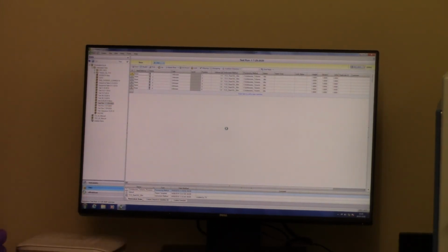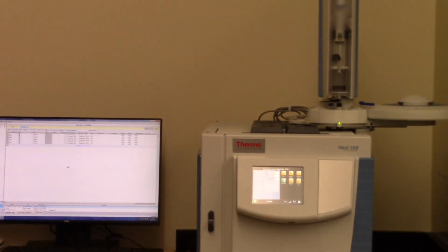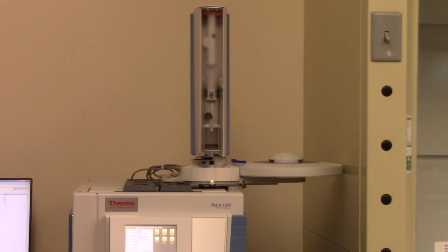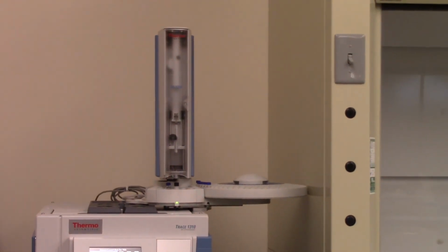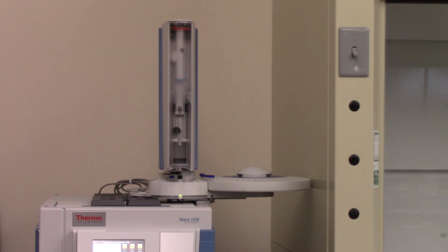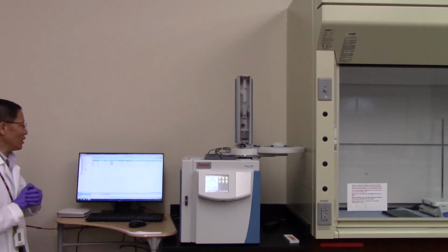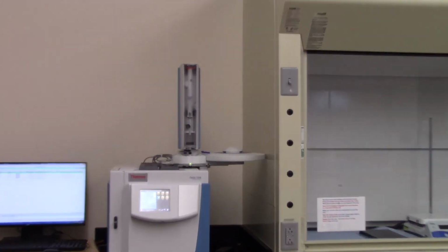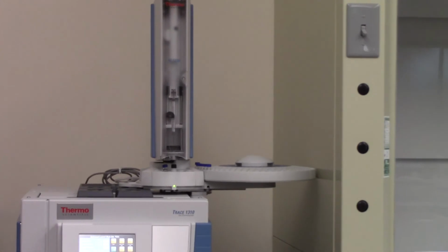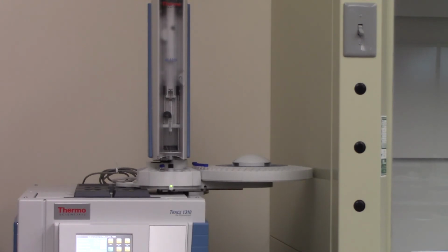And the signal is being sent to the instrument from the computer. And then within a couple of minutes, you will see the action of the auto sampler. And robotic arm will pick up the sample and then use a needle to actually poke into the sample, take some sample out, and then it will inject into the column there. And then each run takes about 7 to 8 minutes, right? So we're not going to watch all 6 runs there, and we'll just have you take a look at the first sample there, and then from there, once we have the first sample, we will display the chromatogram, and we can print it out, or we can save it on the flash drive. So we'll just give it a couple of minutes there.